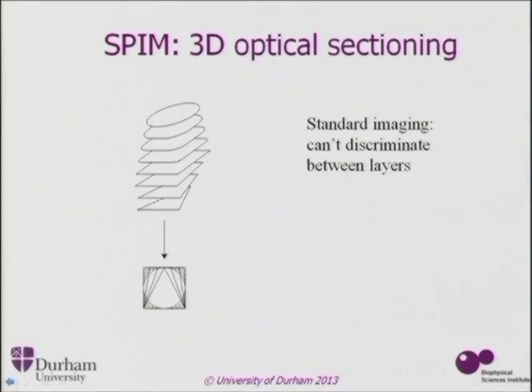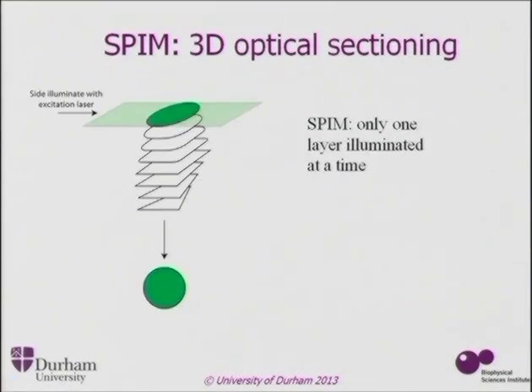In other words, as the problem develops. You can't do that in a confocal system. So we've been using SPIM, which is single plane illumination microscopy. If we have our sample, this is what it sort of looks like. If we look through a normal microscope, it's a mess. So what we do is we put a sheet of light in from the side.